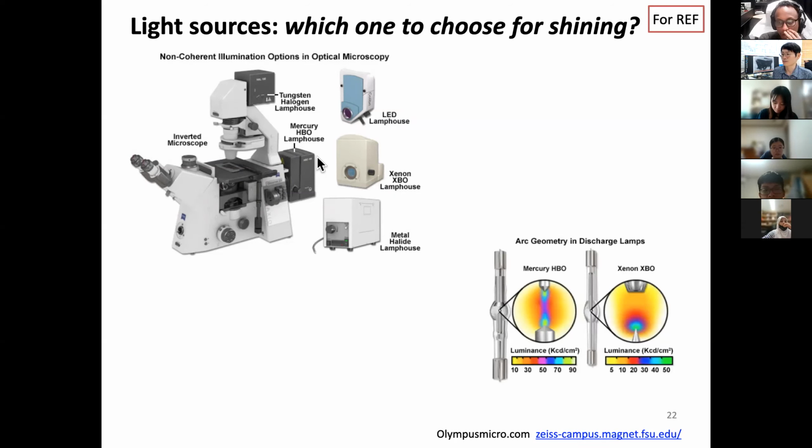Now we are banning the use of the mercury arc lamp, because mercury is actually bad for health. So in hospital environments we are using it less and less, but I used to use this one a lot. It only lasts for 200 hours, but it's expensive. I think one is about $200. So I use it until, like, it says 200 hours, but we use it until 400, until it flickers. This is going to be dangerous. Now I don't want to use it. I want to replace it.